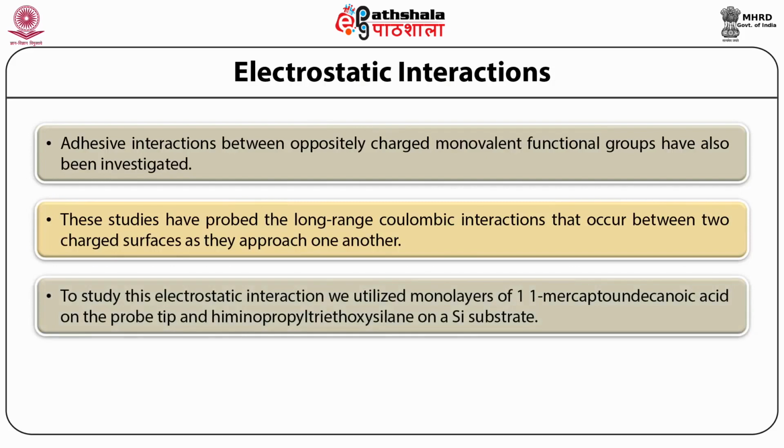To study this electrostatic interaction, we utilized a monolayer of mercaptoundecanoic acid on the probe tip and aminopropyltriethoxysilane on a silicon substrate.